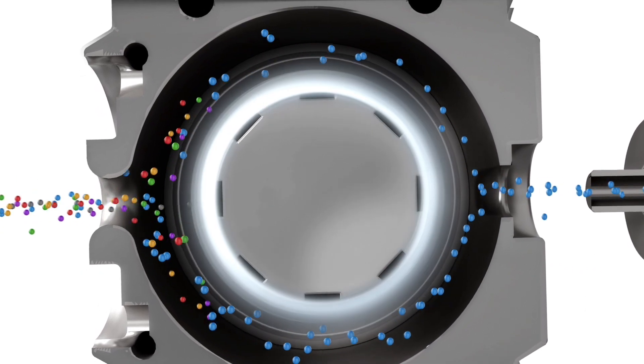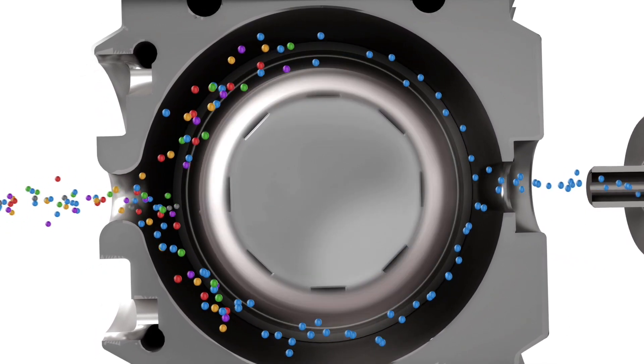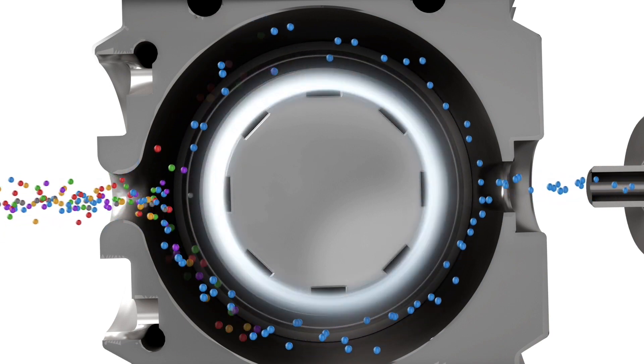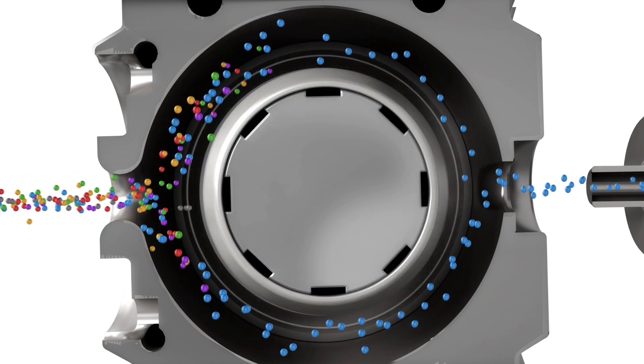Spatial separation of ions is based on their stability when traversing the interface. Only ions with a stable flight path exit into the mass spectrometer for detection and sequencing.